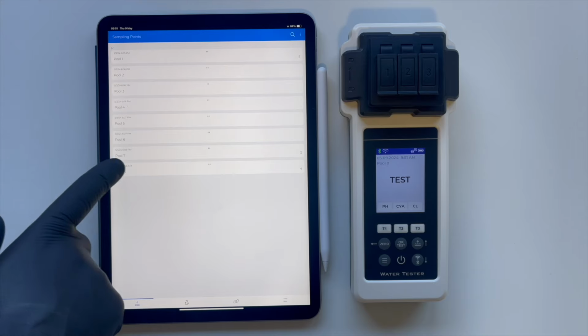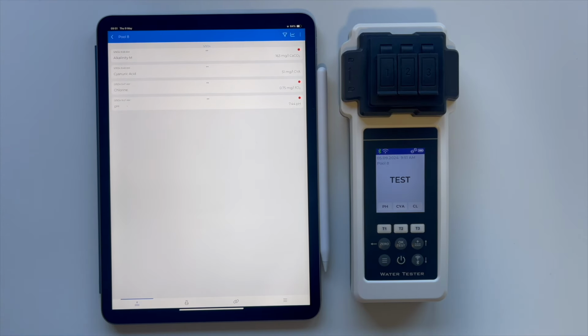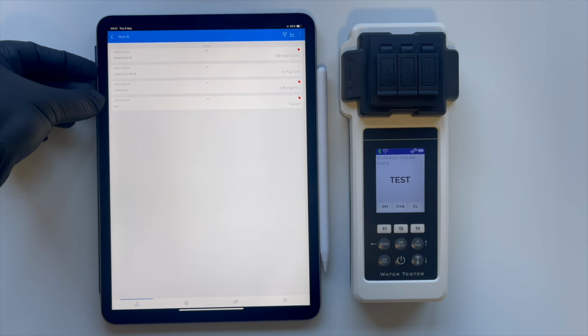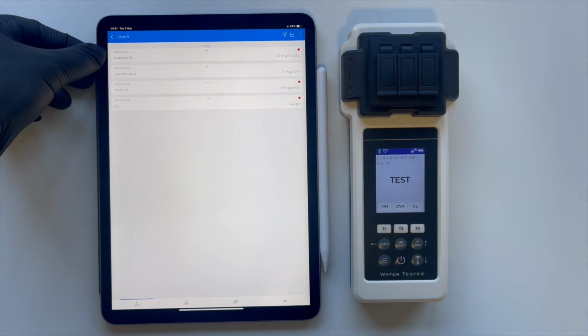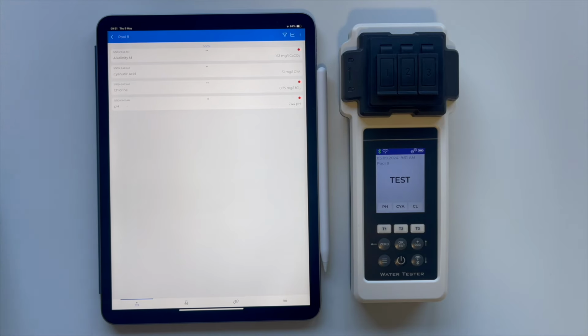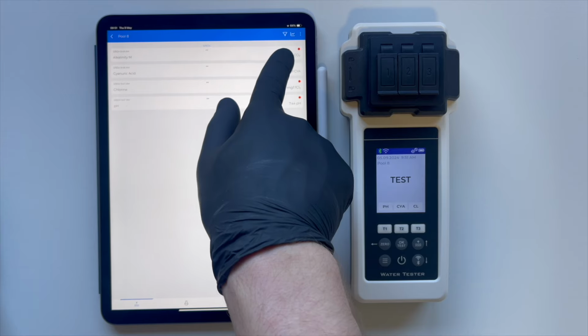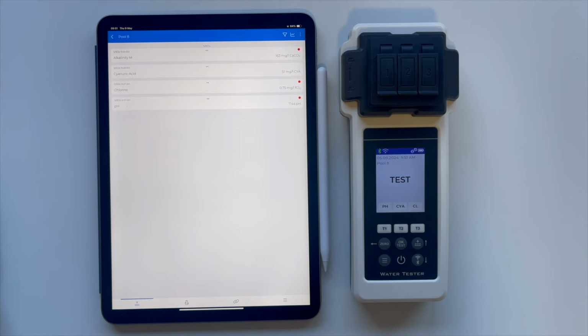We navigate to the Sampling Points section within the app, where we select the specific point where the tests were conducted. Upon selection, we can immediately observe the test results now displayed on the screen. A red dot next to a test result indicates that a parameter is out of the established range according to the settings we previously configured.